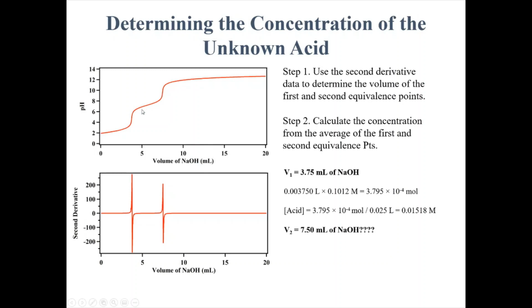So what you need to do is take away this beginning part, because to titrate the second proton, we start from here and go to here. When you look at it, the volume required to titrate the second proton is V2 minus V1. And you'll notice that when you do the subtraction here, you get the same volume as we had above.